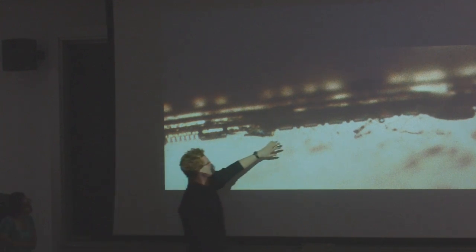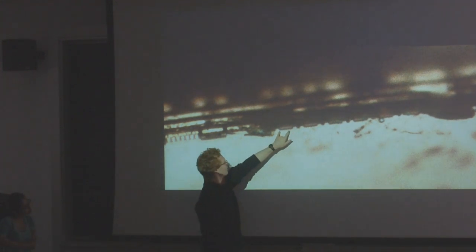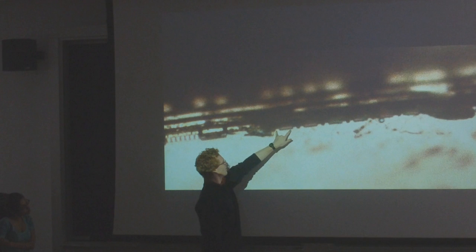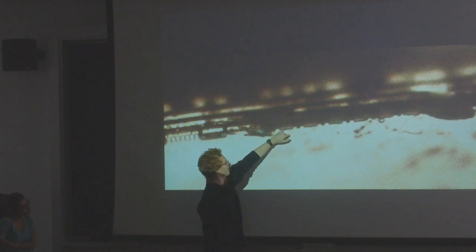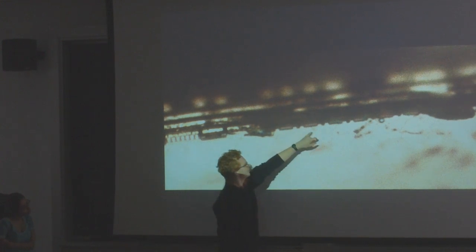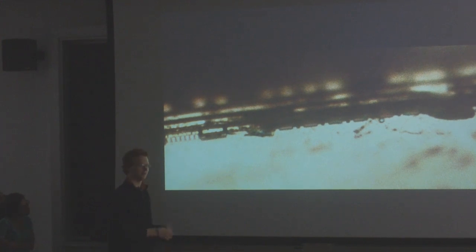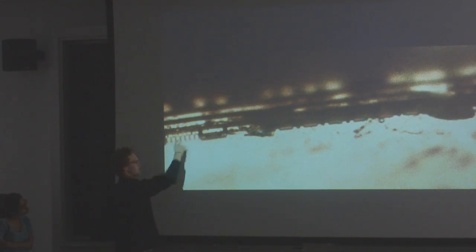What we see here are individual transistors with wiring above them. And again, this is still all optical. If we go in even more, this is pretty much as far as we can go in using the optical microscope. Here we have a source and a drain, a gate in between, all of them, and we have this pattern all the way across the surface of the edge of the chip.